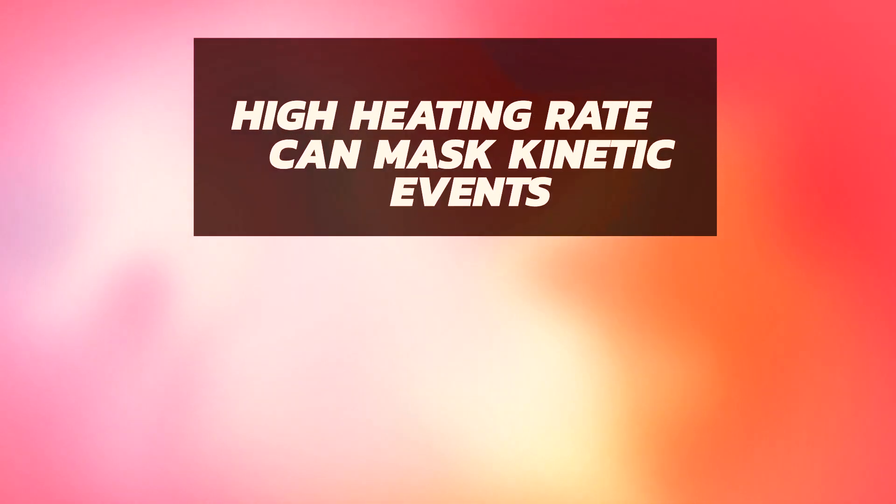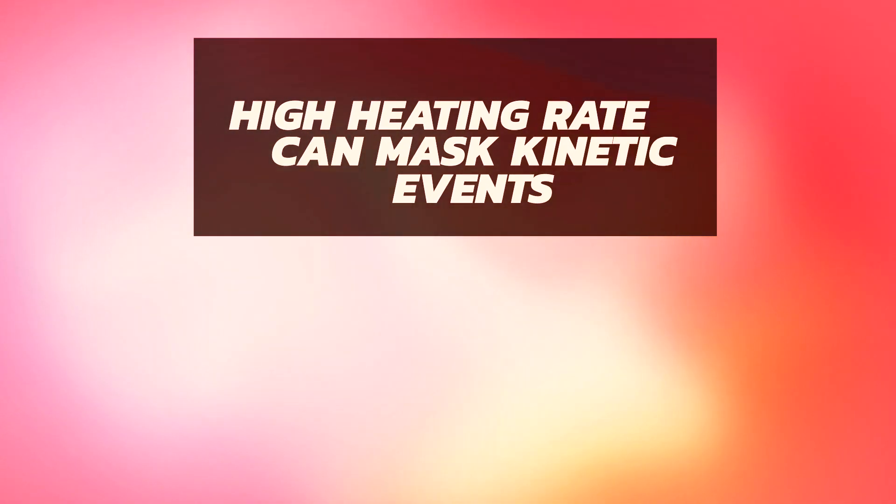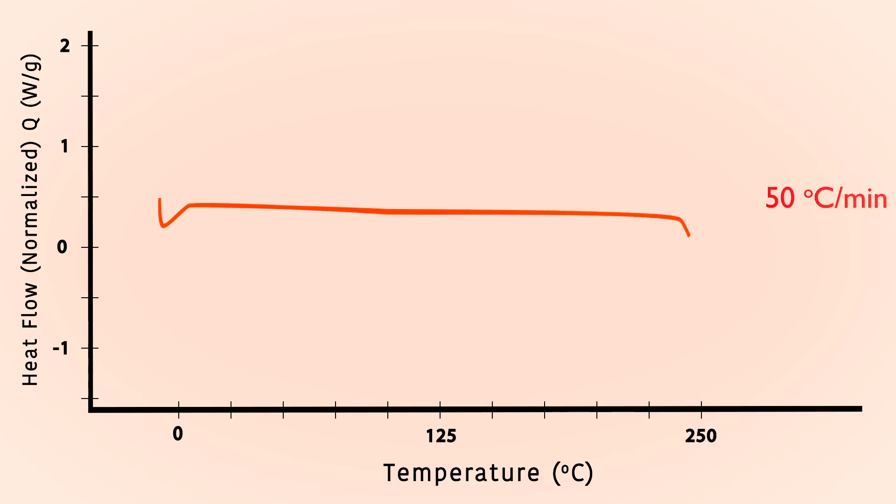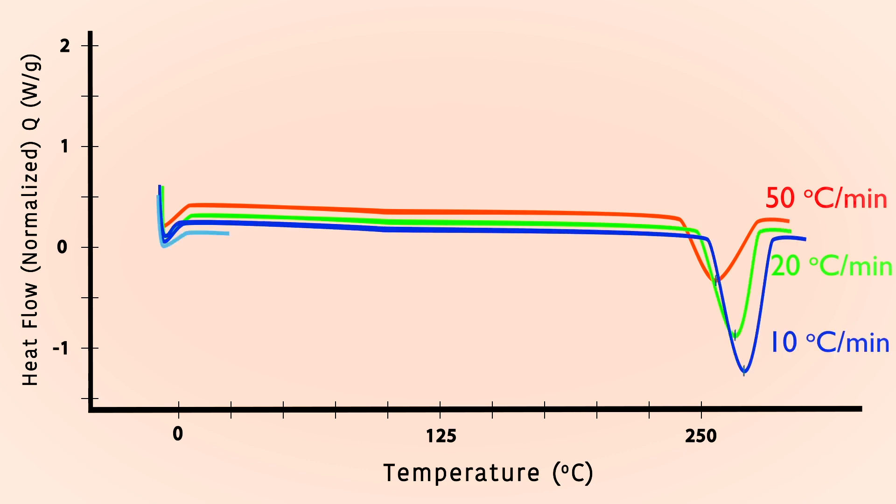The rate at which the sample is heated can affect your testing results. A high heating rate can mask some kinetic effects or create kinetic artifacts, whereas too slow of a heating rate can prolong thermal events. In this example, we see a PET sample heated at different rates. The melting points for lower heating rates shift to a higher value.